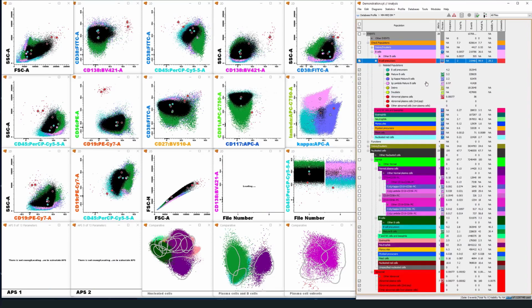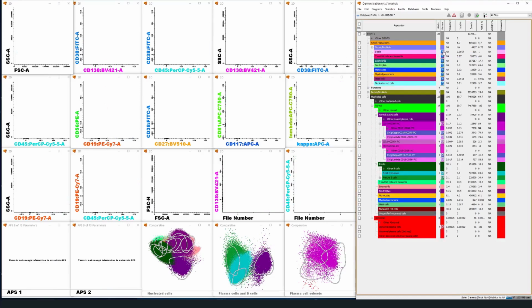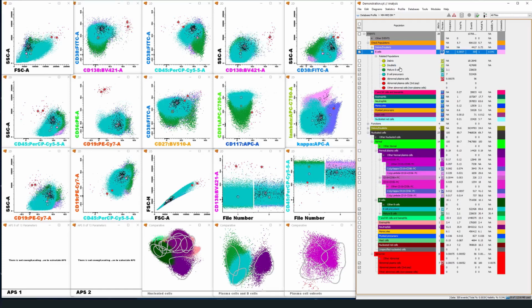And of course precursors may be close to the brightness of plasma cells in some cases, but in this case they appear to be pretty confidently precursors, as in no CD138. CD38 is bright, but not as bright as plasma cells, and we have CD19, and of course CD81 is bright as well, and in the kappa lambda window they don't appear to especially express either kappa or lambda. So this would be precursors. And usually there's some leftover cells that are harder to assign, and these appear to be mostly precursors with maybe some kappa lambda, but in the interest of time, let's say they are precursors.